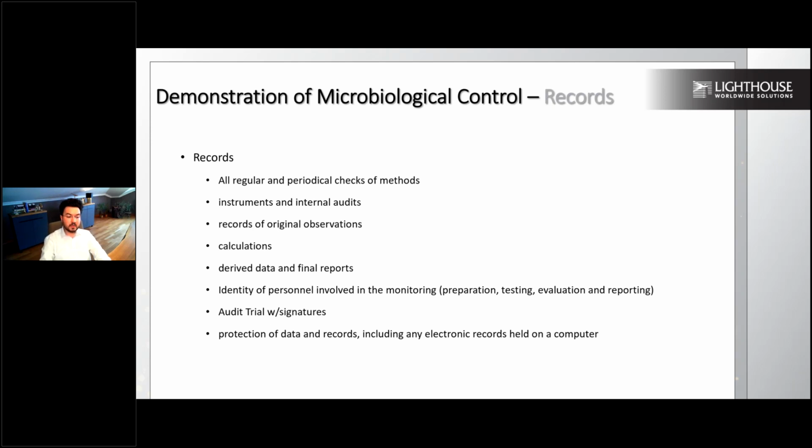Sometimes we are seeing that the end user comes up with the final result after sample tracking. However, their records are not really showing the data that they are collecting from the field, or the way they are collecting data is not parallel to the records that they have. That's why it has to be up to date and reflect what you are doing in the field versus your records.